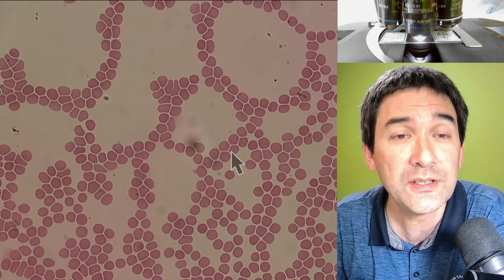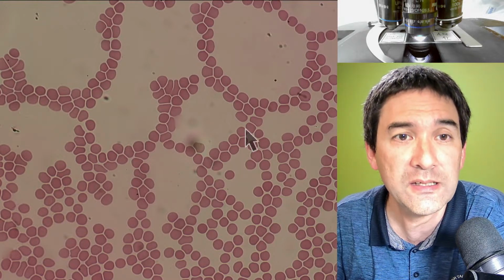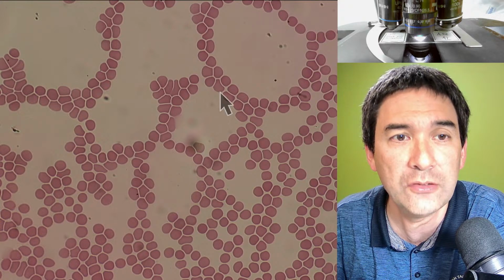And there's another thing that I would like to show you here on this permanent slide, and that is, look at how the red blood cells are arranged. You see they're a little bit pattern-like. They're kind of ring-shaped over here. There are some empty spaces in between here.